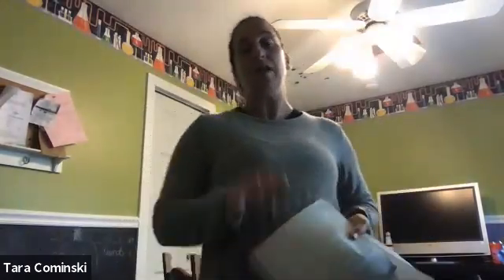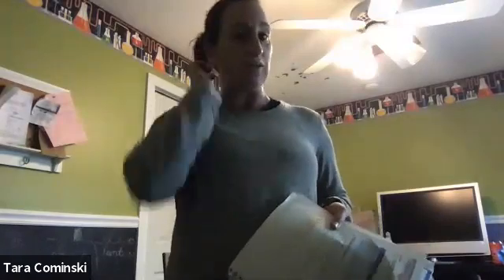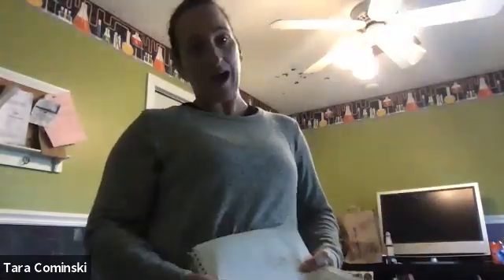All right, so with that said, let's get started. Again, if you have to pause as you move through, that's fine. You need to make sure you have the lab, that PDF, in front of you, okay? I'm just going to be referring to the page numbers, essentially. I'm not going to pull it up on the screen because I think it's going to be too confusing for me to be toggling back and forth.